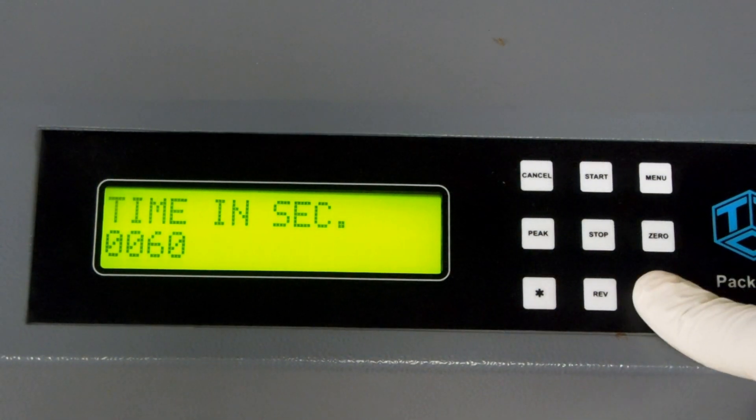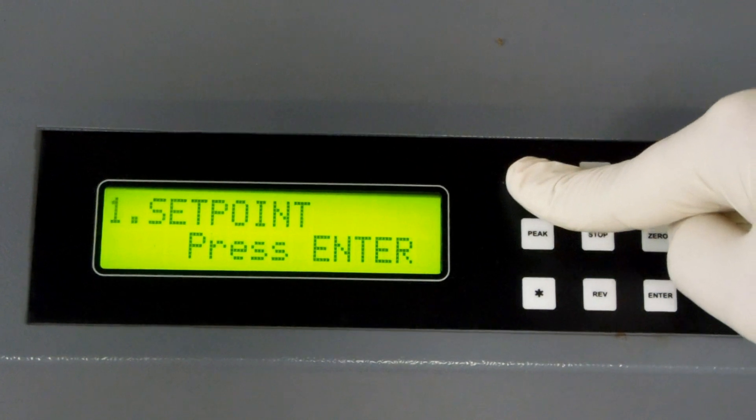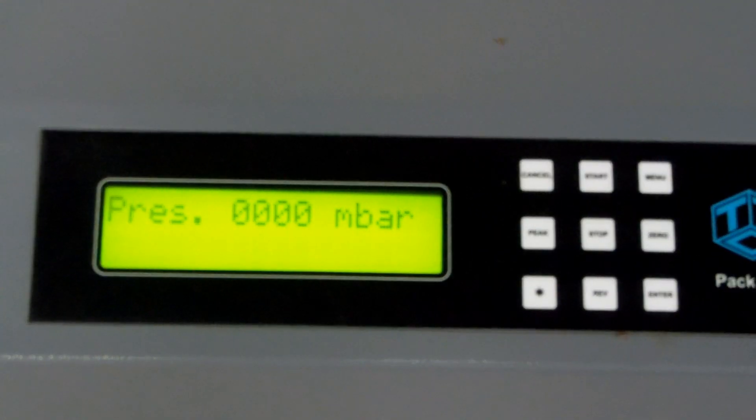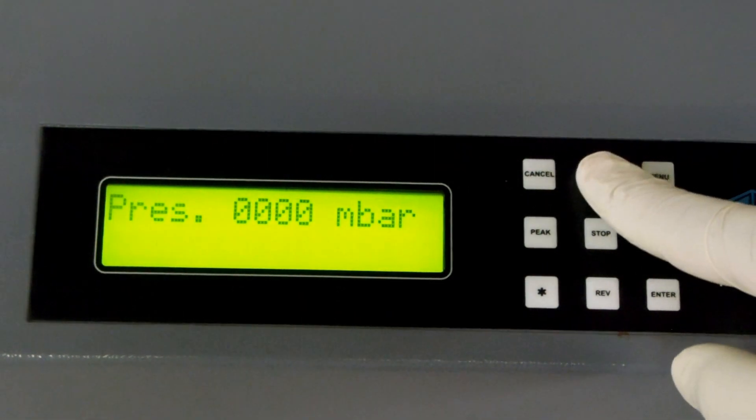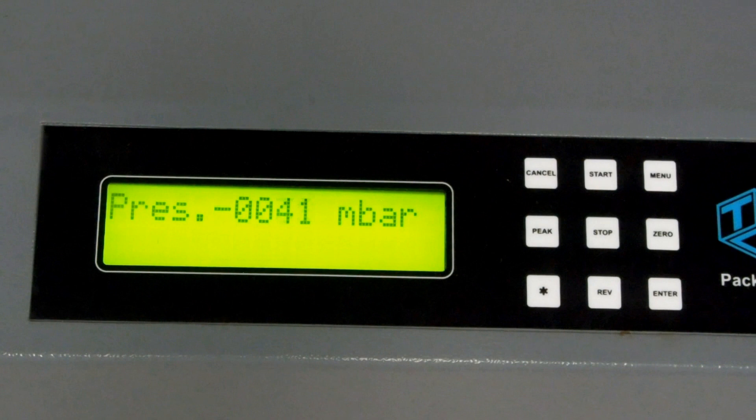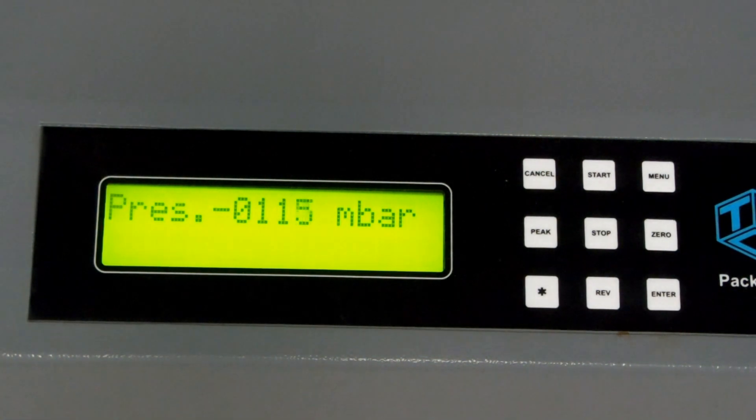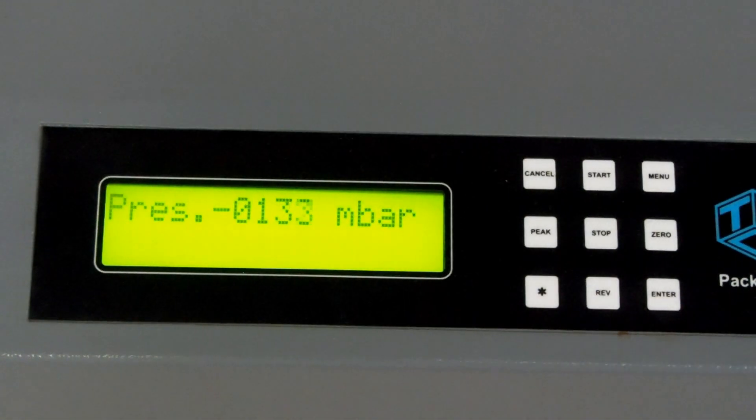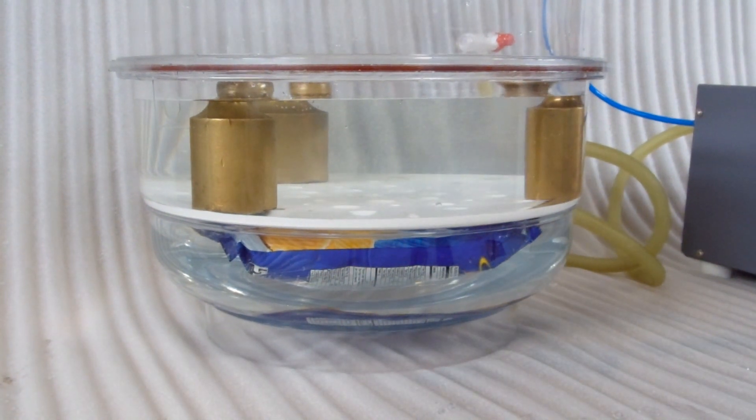Press enter to accept. Press cancel to exit the menu. Press zero and then press start. The vacuum pump will now start generating vacuum inside the tank. Because of the vacuum, you will see the pouch swell up.